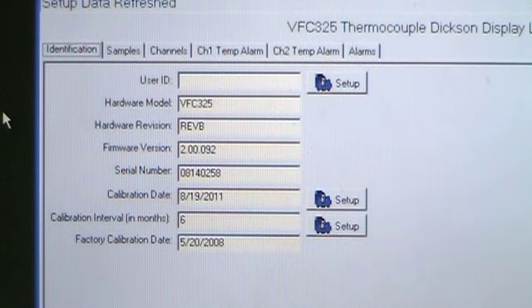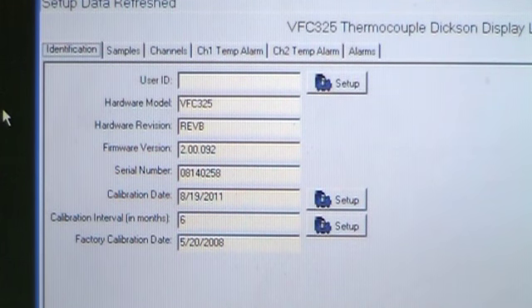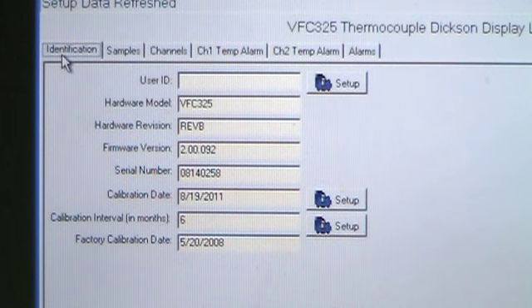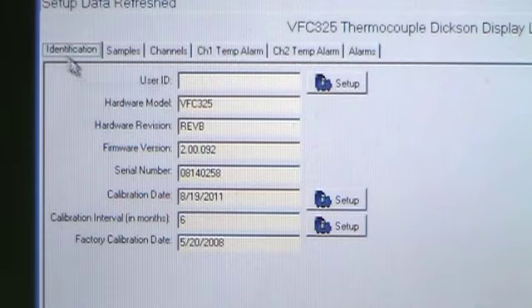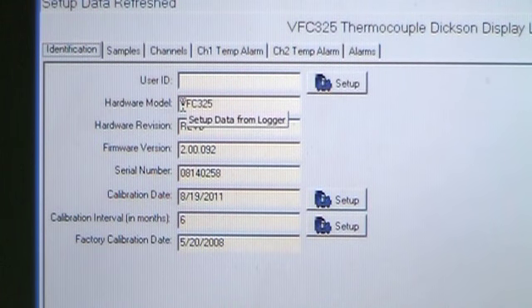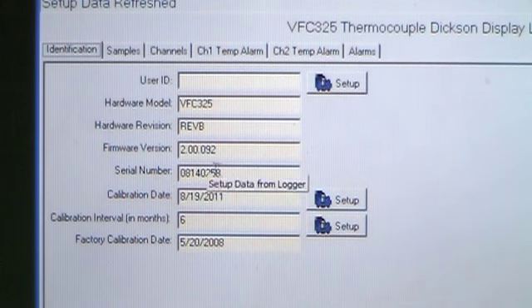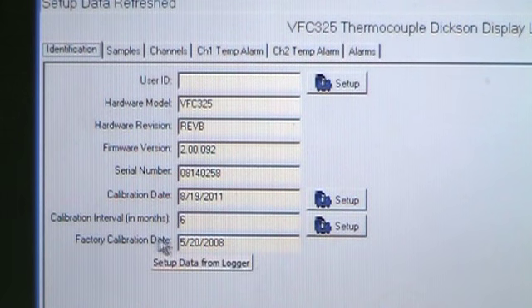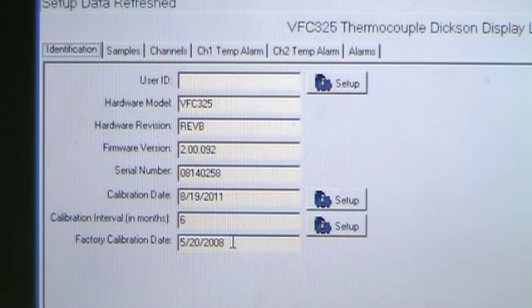The Setup window pops up with six tabs. It automatically opens to the Identification tab. All the fields on this screen will populate with information about this logger, including the hardware model number, serial number, calibration date, and factory calibration date. This confirms that Dixonware has recognized the logger.